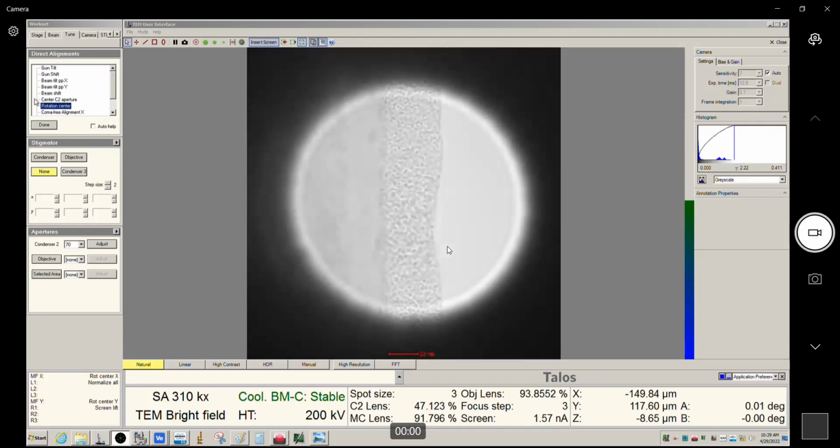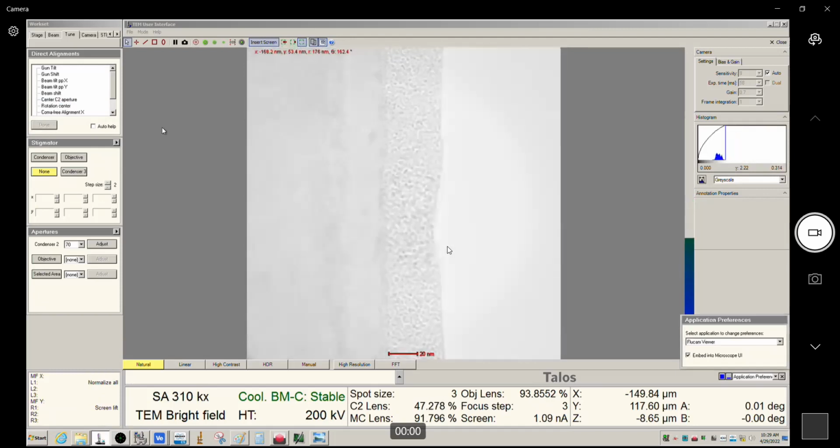So, all right, let me click done here. Go back to my list, check this off. Alternative rotation center technique. Okay, all right, next thing, under focus versus over focus. I'm going to increase the mag here. We'll go to 500,000.